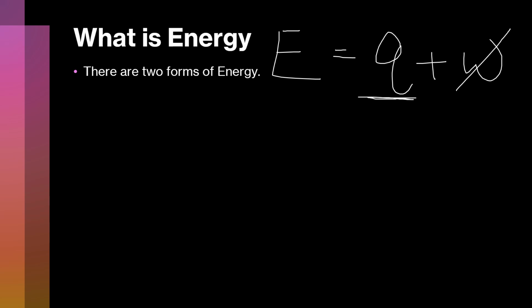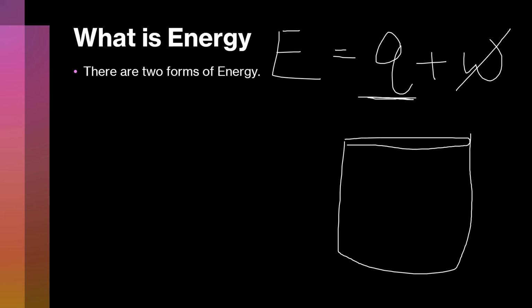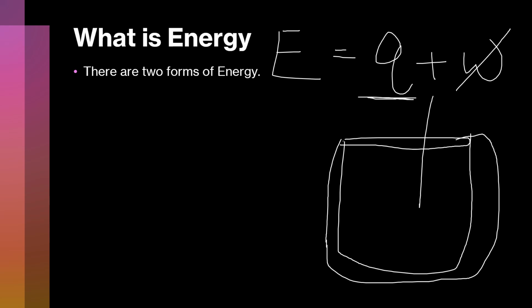So how do we usually start with the experiment? We usually start with an enclosed container, right? So this is some kind of foam insulated cup to keep all the heat inside. And you have some kind of a measuring device here. In our case, it would be the temperature probe. Here are your solvents. And this is where all your reaction occurs.